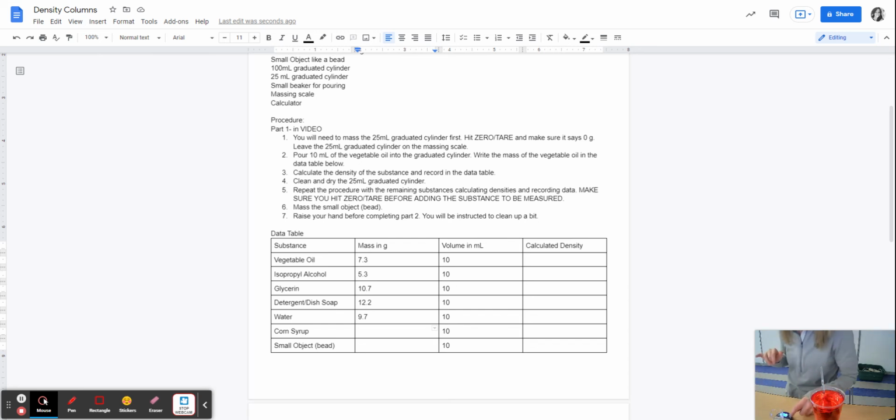We're going to tare it and add it in. I'm going to take it off like I did before. Okay, I know that number is going to be right when I put it back on. It's nice and slow, so getting it to 10 is kind of easy. All right, I want to get some of it off of the side.